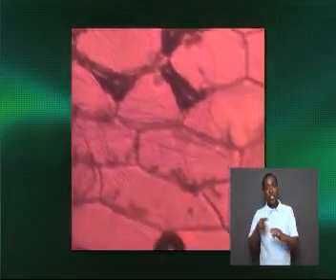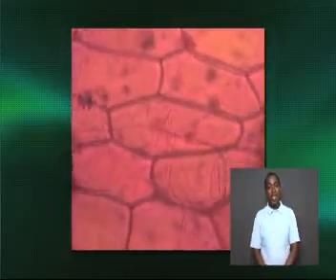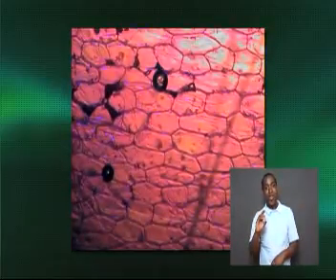Slide cells, tissues, or individual organisms are often the specimens that are viewed using a light microscope. These very small particles of biological matter are stained or treated to help the observer see the specimen more clearly. Stains are chemicals added to the slide tissues to make the cells, or parts of the cell, easier to see.